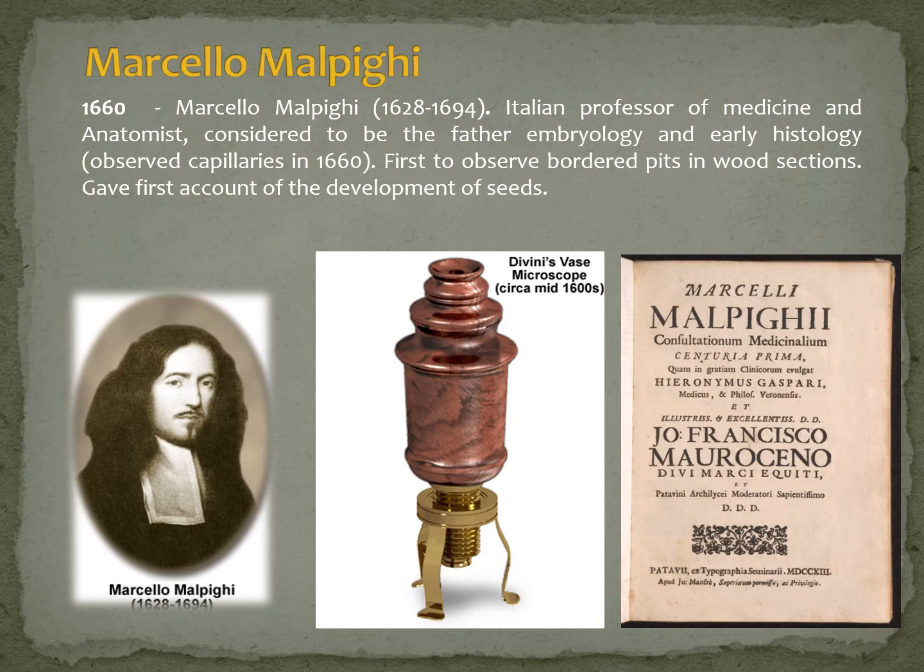These compound microscopes are difficult to focus on the sample, and in particular because the sample is difficult to illuminate. So most samples were not transparent, and the light had to reach the sample using glasses or candles, and it was one of the major problems.